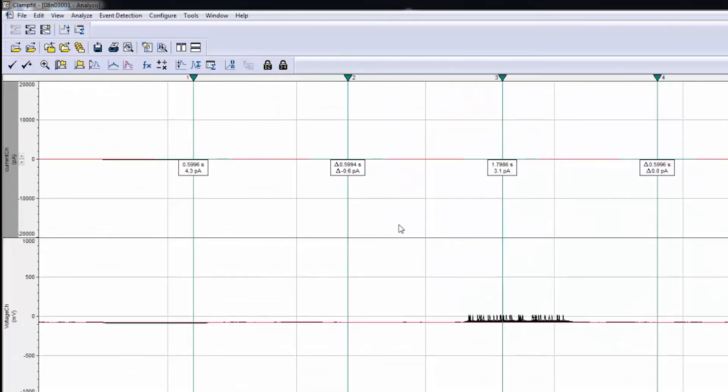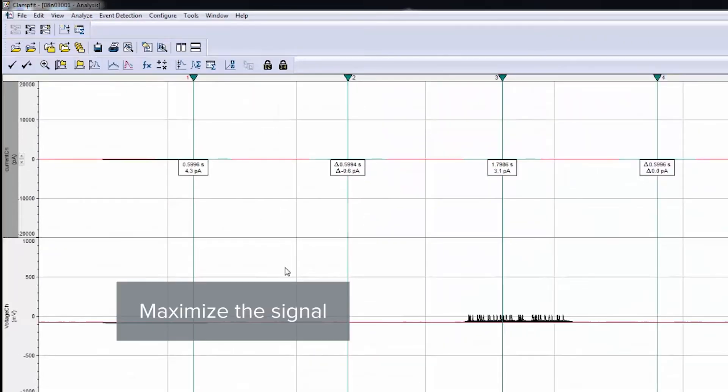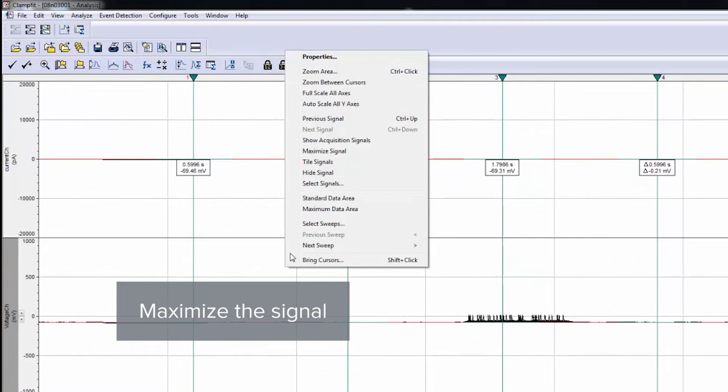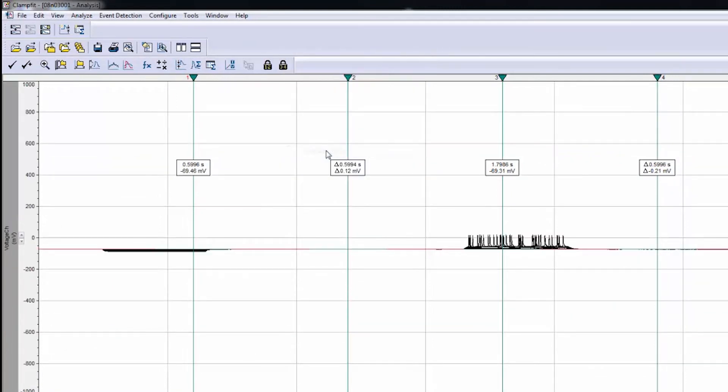To maximize the signal of interest, right-click to open up a menu and click Maximize Signal.